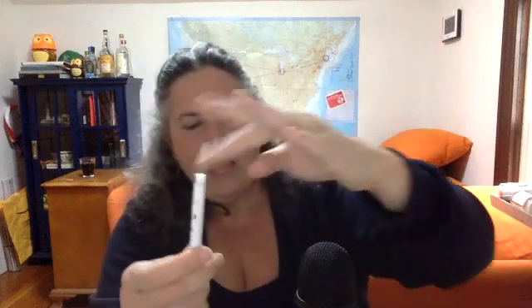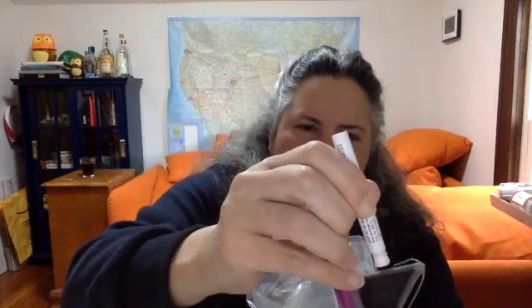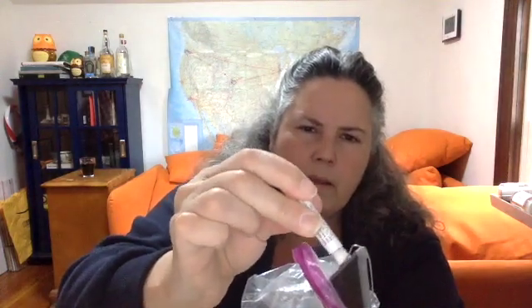I'm cracking the lead check swab, opening it to make sure the contents is yellowish — that means it's activated. It's a chemical reagent, generally meant to test for lead in paint. However, it might test for lead in other things. In an instance like this, when the object is basically covered in a strip of solid lead, it should react pretty quickly. I'm going to drop some of the yellow liquid onto the item and rub it. That's what it looks like when you test actual near-pure lead with a lead check swab — it turns red immediately, a bright pinkish red.